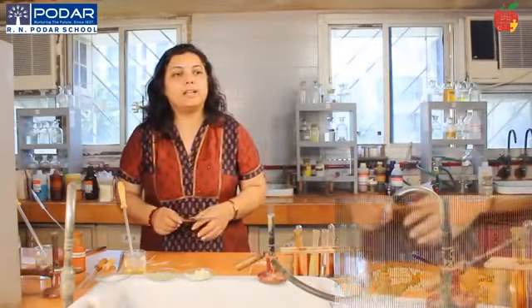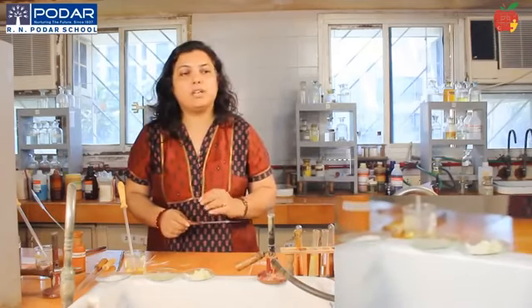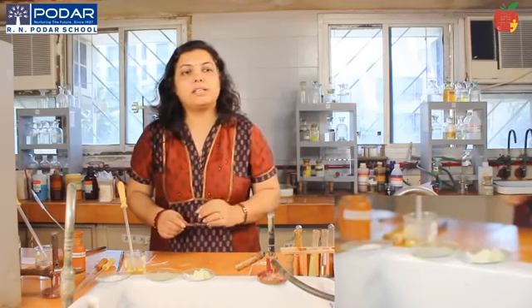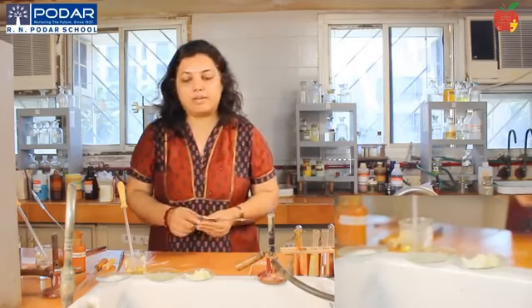For the cation analysis, you just follow the scheme stepwise. You will not face any difficulty in doing any of the tests. The only tricky test in cations is your flame test, how to perform it and to observe the flame.